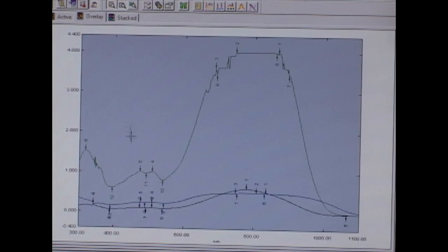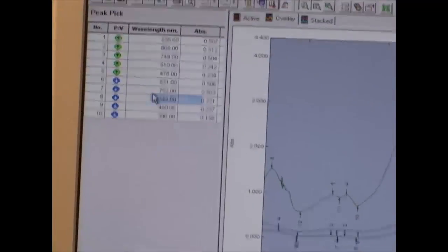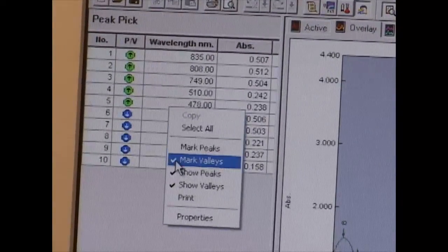If you don't want to see all the peak information, you do right click and unselect marked peaks and valleys for current spectrum.